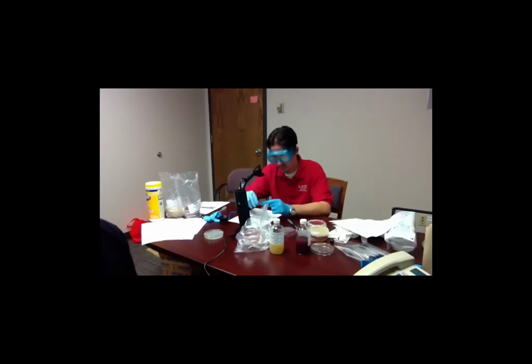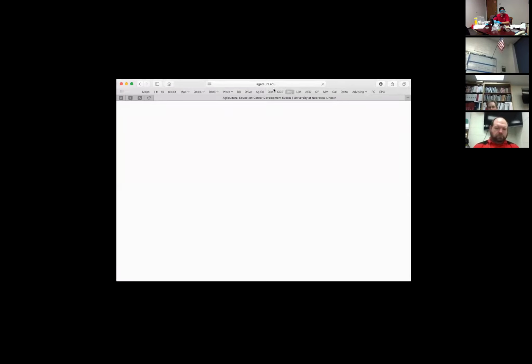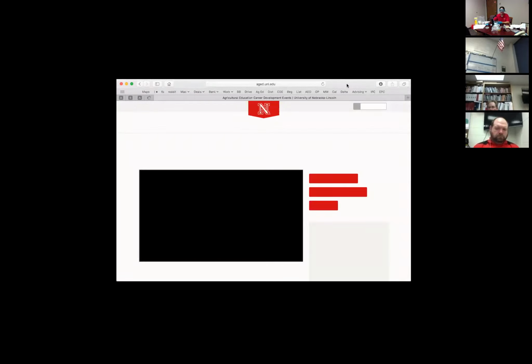While I'm doing this, Nathan, talk about what you might expect a science laboratory to have in regard to all of this. How to maybe dispose of bacteria plates once we're done with them. What are some best practices you'd recommend regarding that? As far as what you need to do this, the kit's going to come with everything you need.